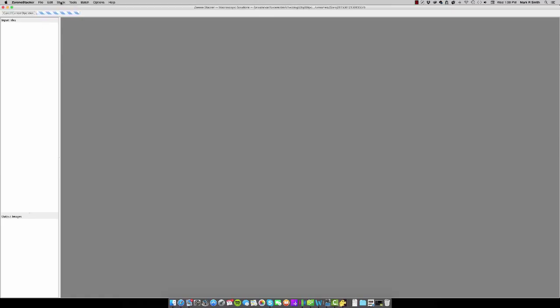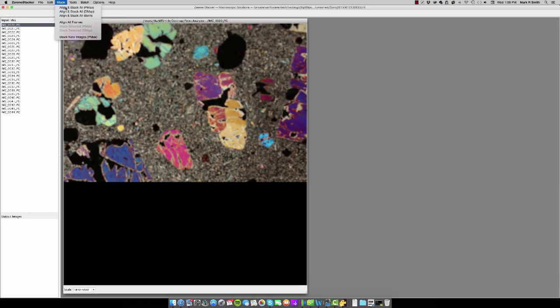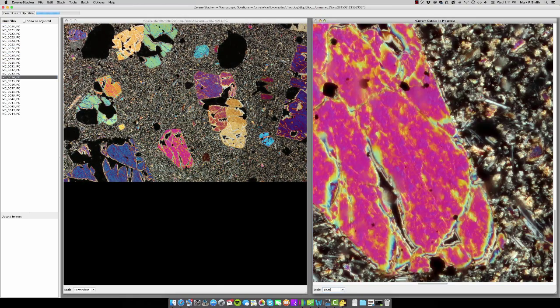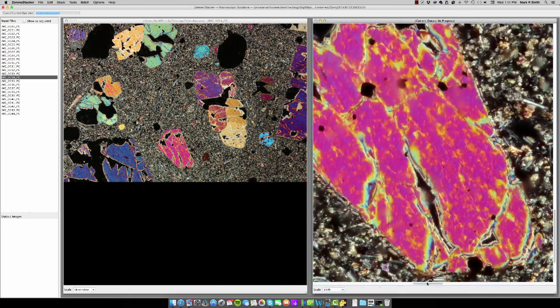From here, what I'll do is I'll go to stack and I'm going to stack this in Pmax. What that's going to do is it's going to take the individual focal plane from each of the 25 images that we just captured and it's going to stitch them together to render an image on the right that's completely in focus.